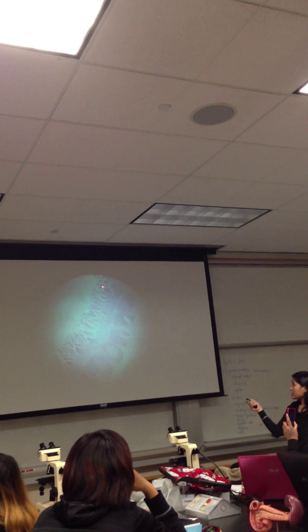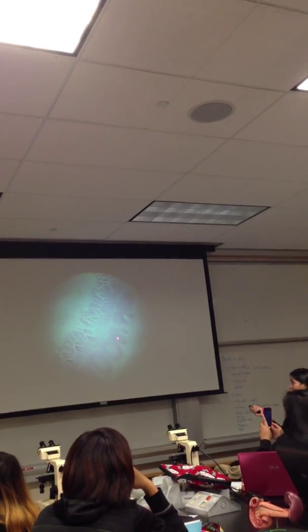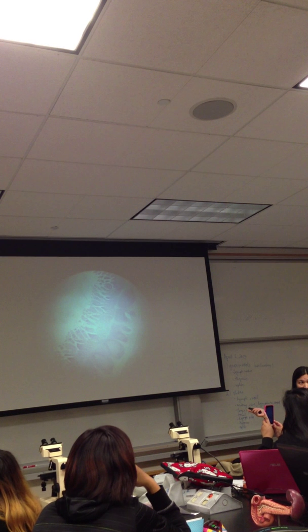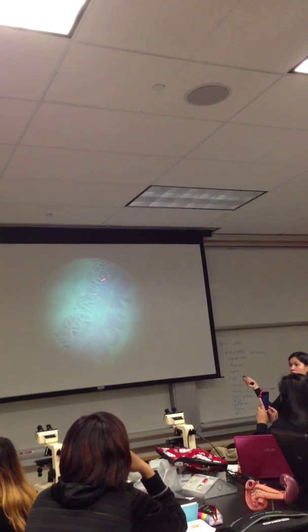Okay, and you see that? It's very similar, right? It's just a closer view. You see these aggregates? You see those? Those are also Peyer's patches. Okay? And your landmark should be this one. They are the villi, right? Like the mucosal folds. Okay.